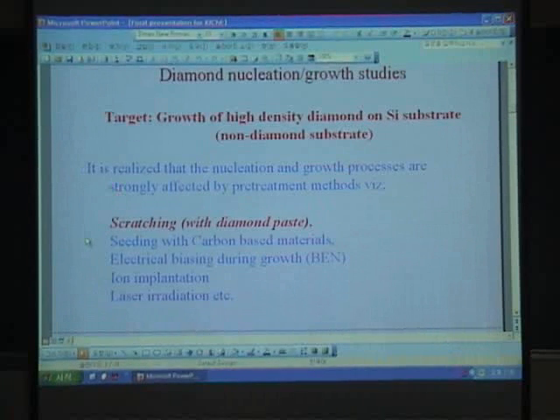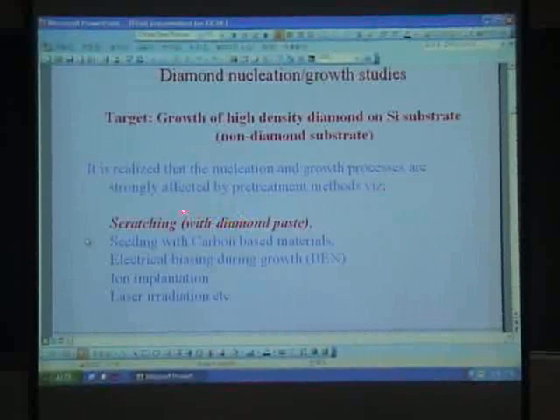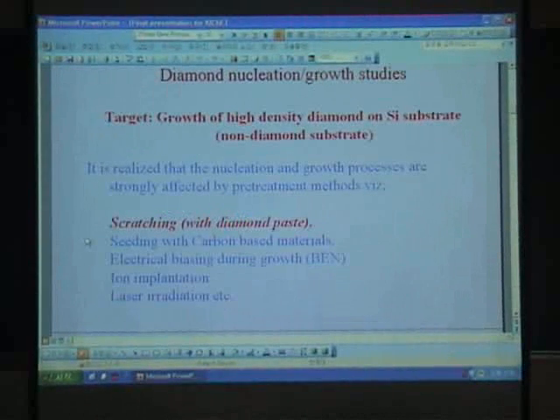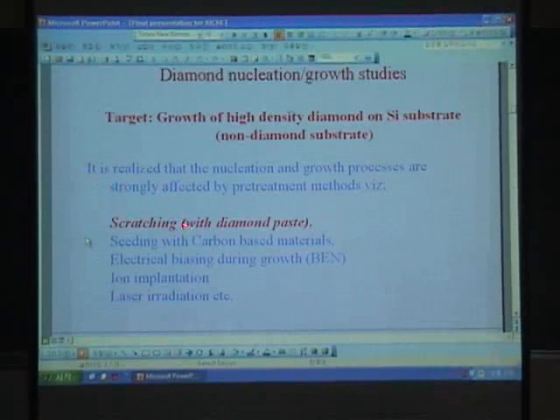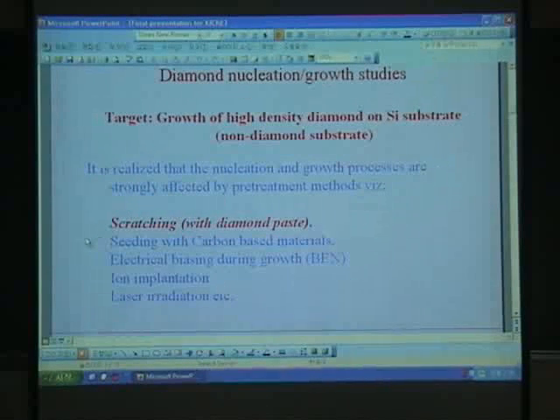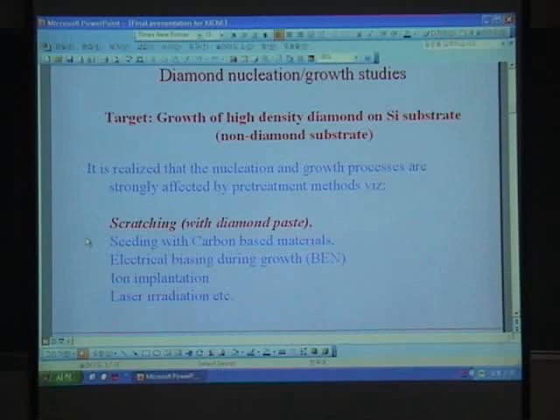So many researchers use, for that problem, a coating, some type of buffer layer. So here we use zinc as a buffer layer to overcome that type of problem. Zinc is also very interesting here because zinc has a melting point of 419, but our substrate temperature is 750. So probably there is evaporation of zinc.